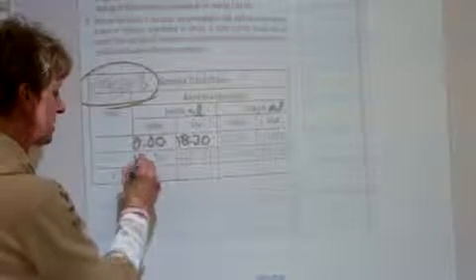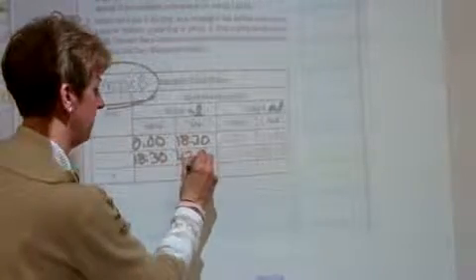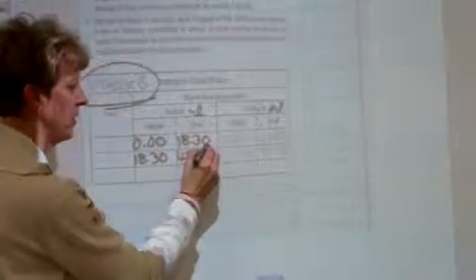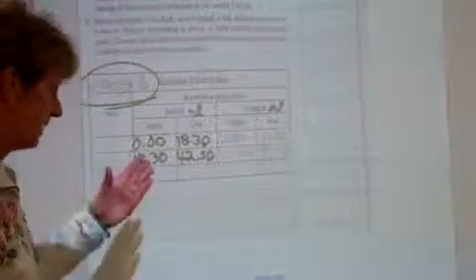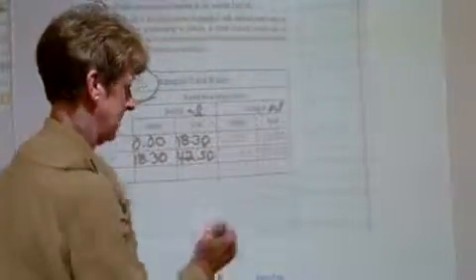Trial 2, we started at 18.30 and we went to 42.50. Please make sure you have your data out to the hundredths because that was what we used. We had a burette and you can read to the tenths, so you estimate that last place.